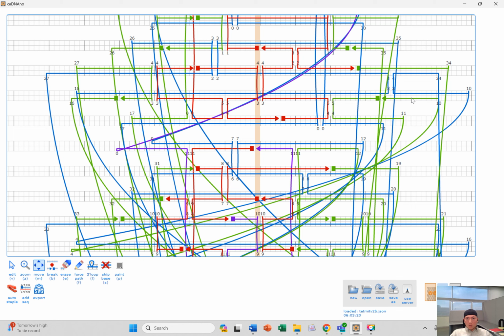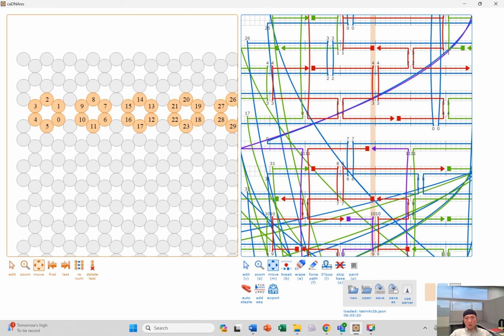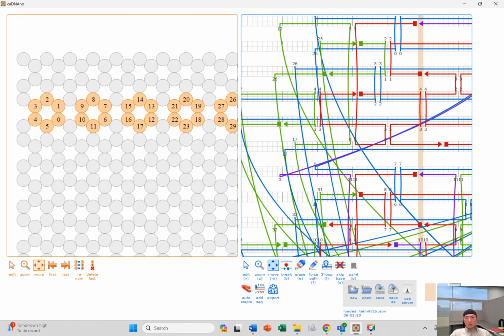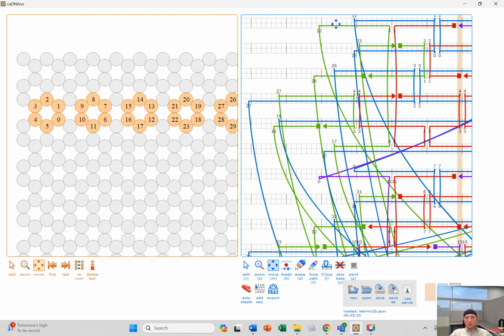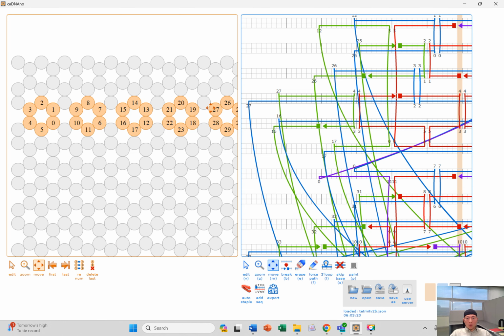So it goes from here, I believe it's 3, 0, 1, 2, 3, yeah. It goes from 3, which is an exterior helices, that's the long one, and it'll jump all the way to 27, which is another large, long helices. That's the exterior helices. And if you follow it to 27, so green 27.